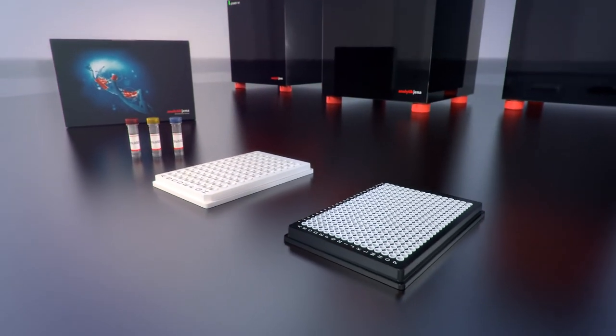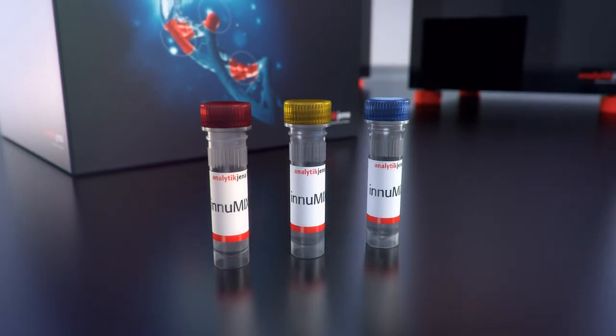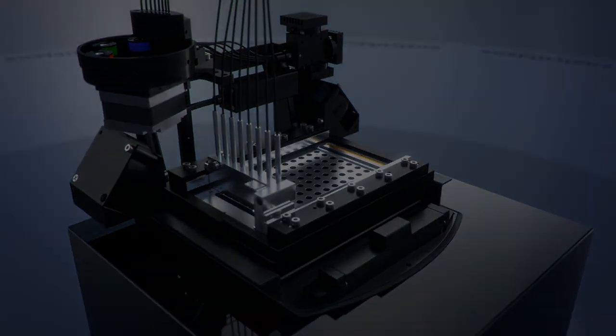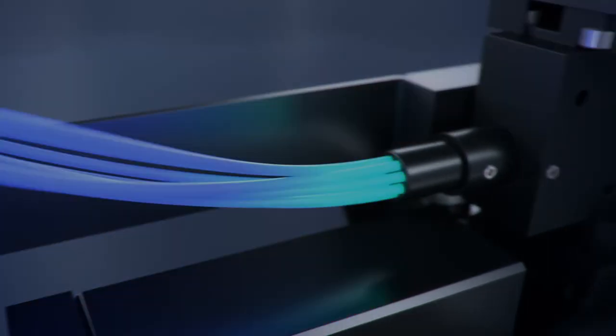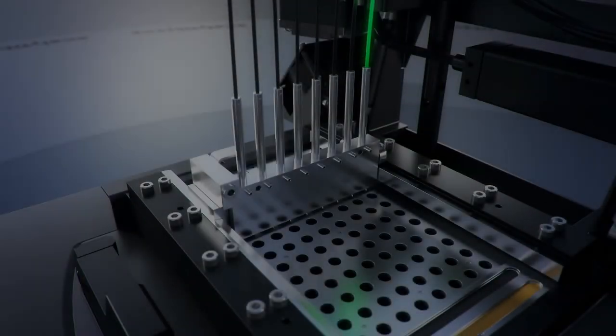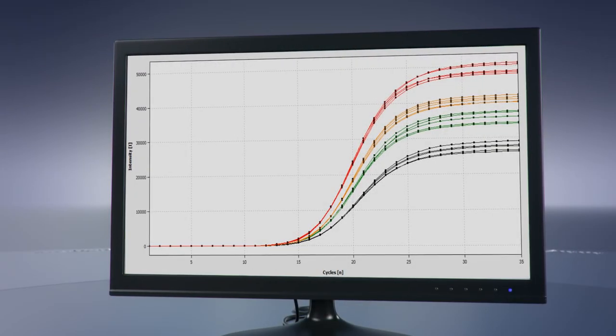The silver sample block technology, patented fiber optic system, unique LED light source, flexible filter module system, outstanding homogeneity and uniformity, multiple result evaluation methods, and linear gradient tool.